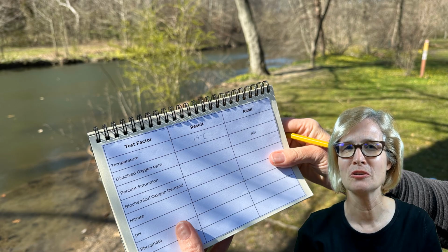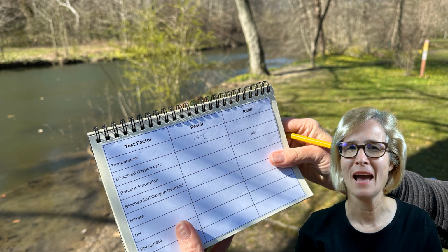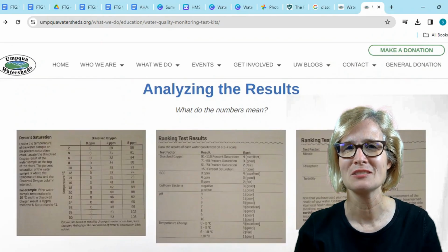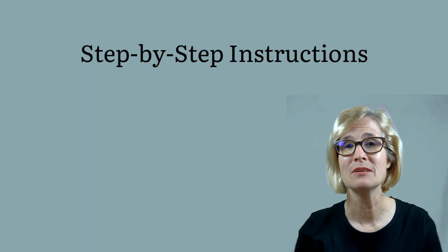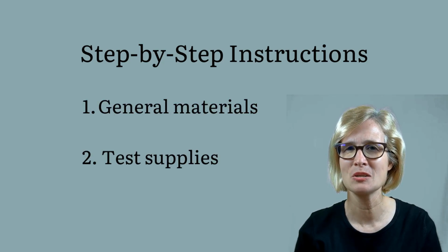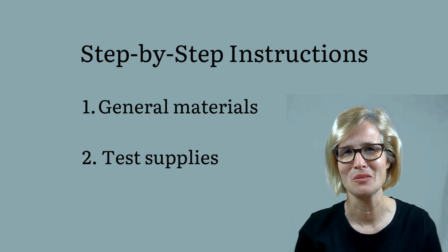Especially for your older learners, it will require them to be precise in measuring, be accurate in recording results, and to make conclusions based on the test results. So now you will be given step-by-step instructions on how to gather your general materials and test supplies before you actually go on your field trip.